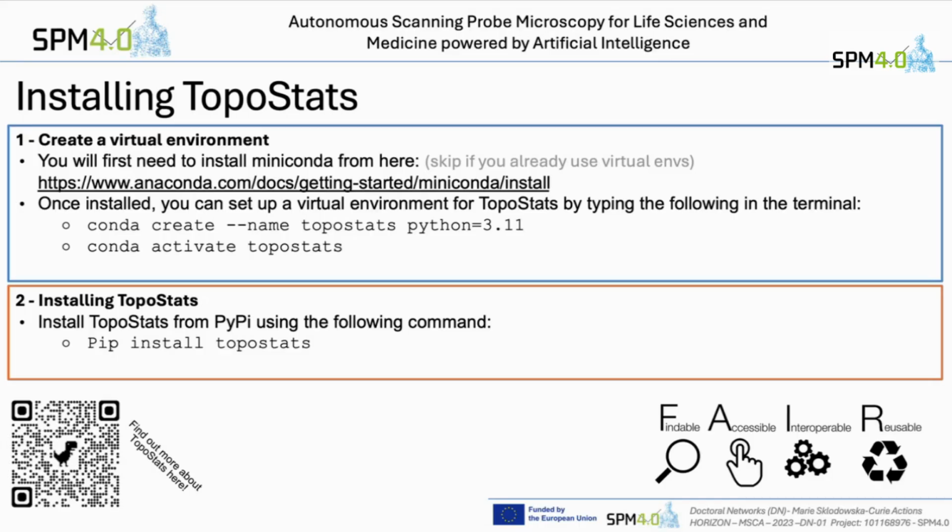I think it has five stars. Did you do the convert through there? Have you opened it in the plot?